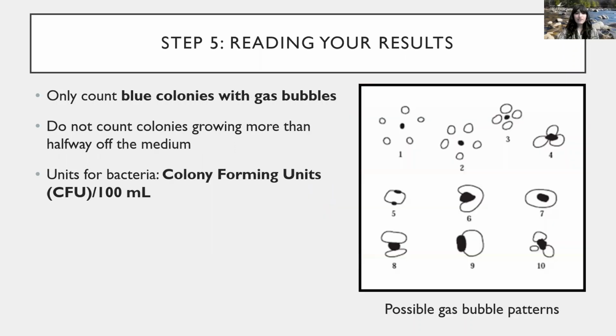And step number 5 is going to be reading our results. So 24 hours have passed. Our plates have these different colonies growing on them. We're not sure what we're looking at.